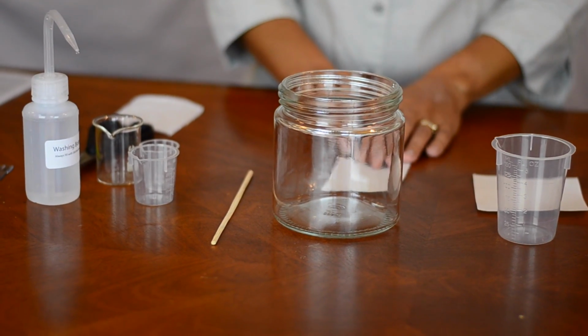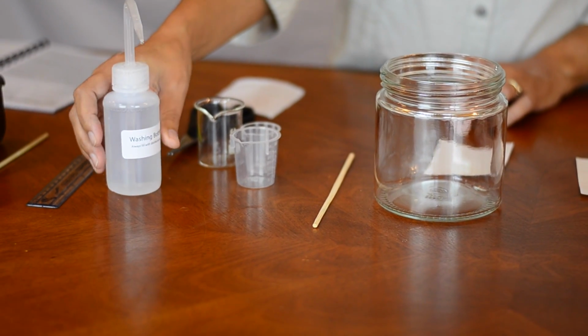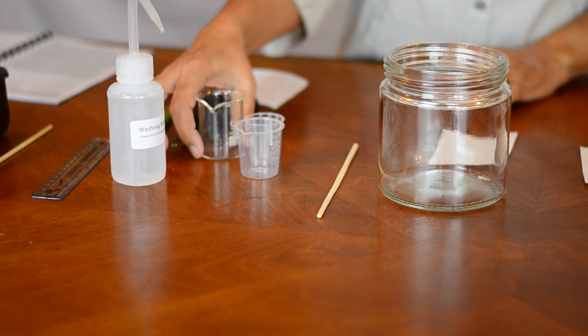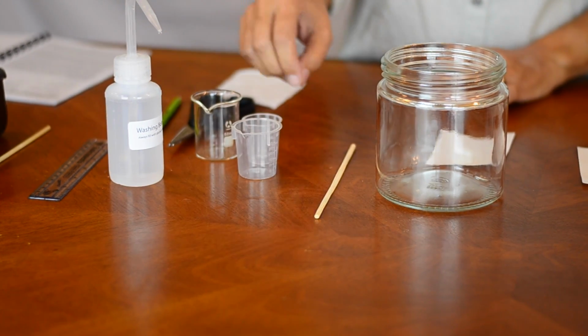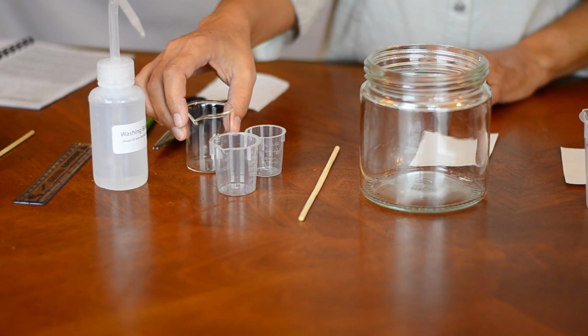Not a big deal, but I just thought I'd have some fun doing it that way. Other items that we'll need: some distilled water in my wash bottle. I'm going to use that to rinse out my gear before I use it to make sure I don't have anything that can contaminate the reagents, and some extra little beakers.